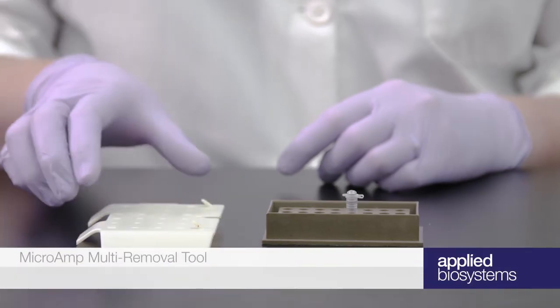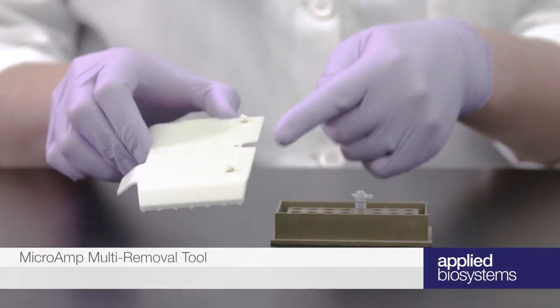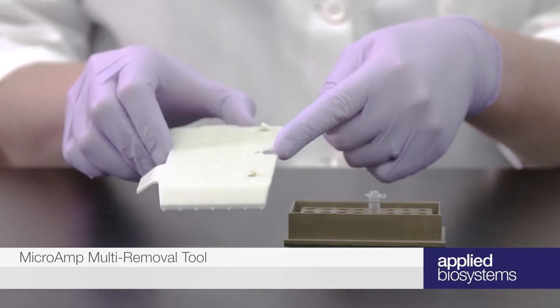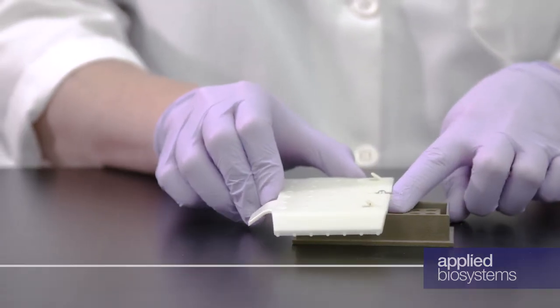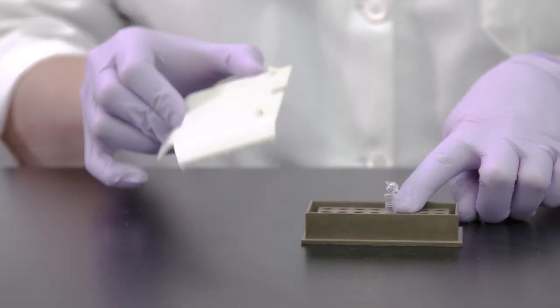You can use the multi-removal tool to open the attached caps of individual tubes by inserting the tube into the U-shaped slot. There's a small catch on the tool that will pry the cap open.